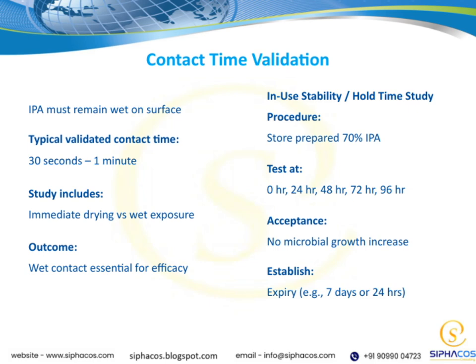A critical part of this study is contact time validation. Basically, we need to make sure that the IPA remains wet on the surface for a sufficient period, typically between 30 seconds and 1 minute, to ensure proper disinfection. The study compares immediate drying versus wet exposure, highlighting that maintaining a wet surface during this contact time is essential.